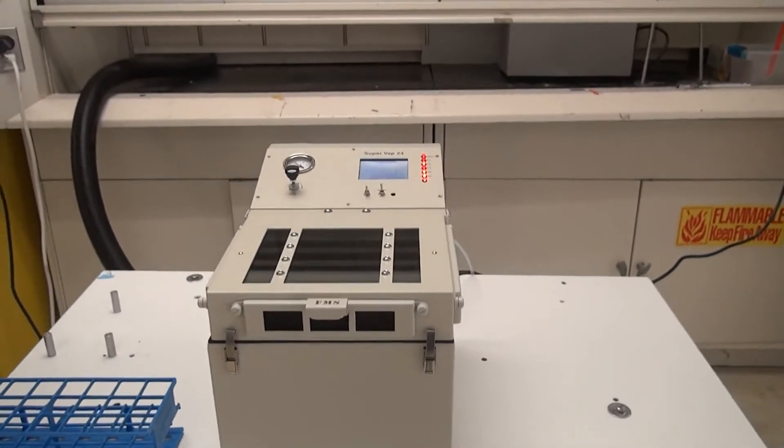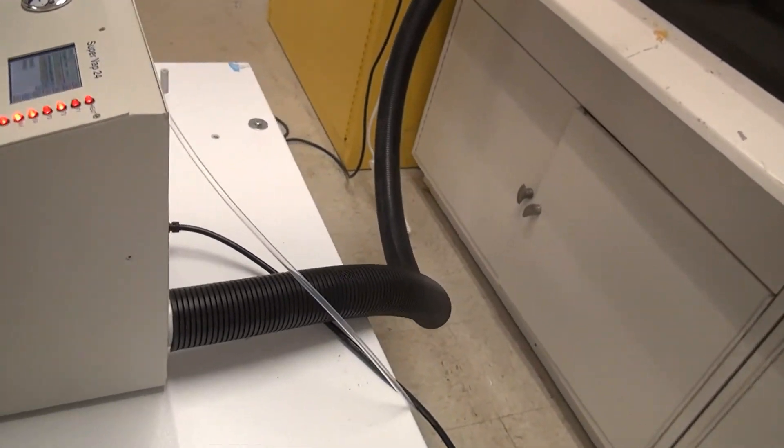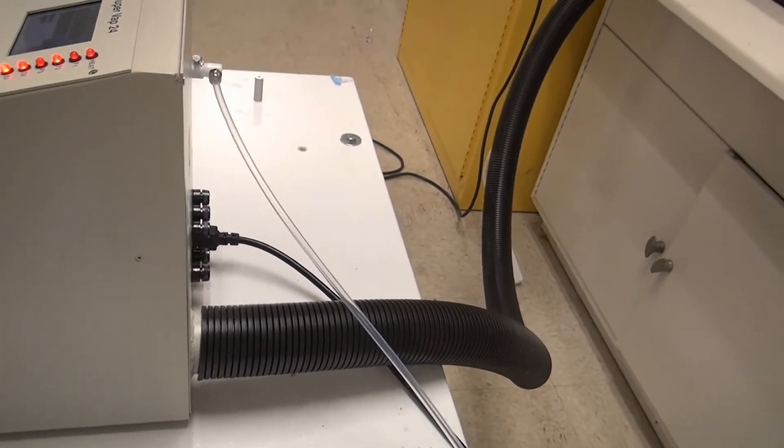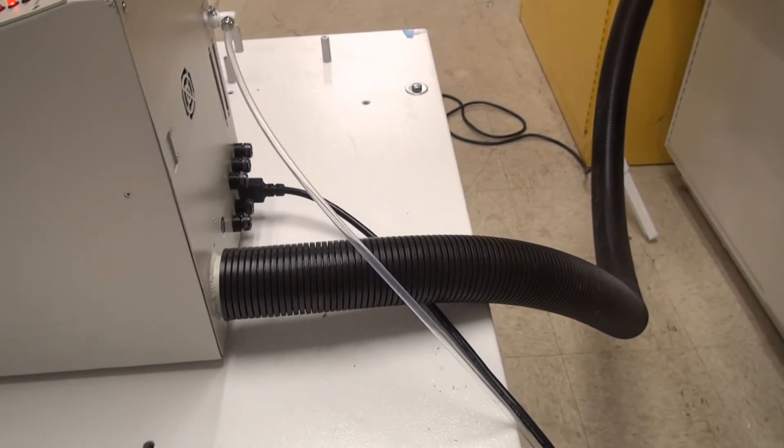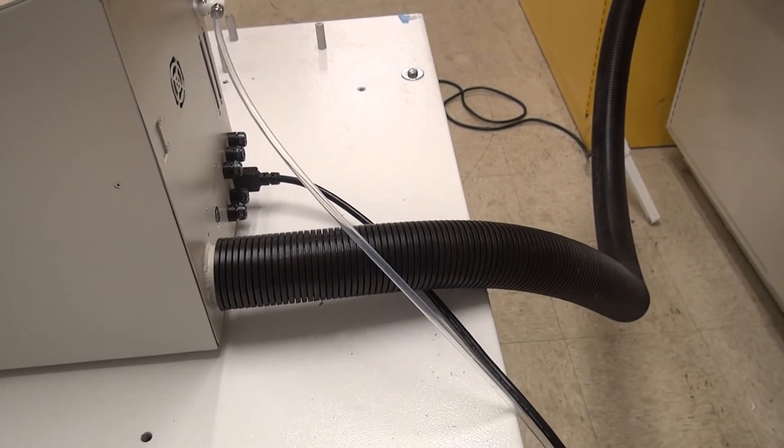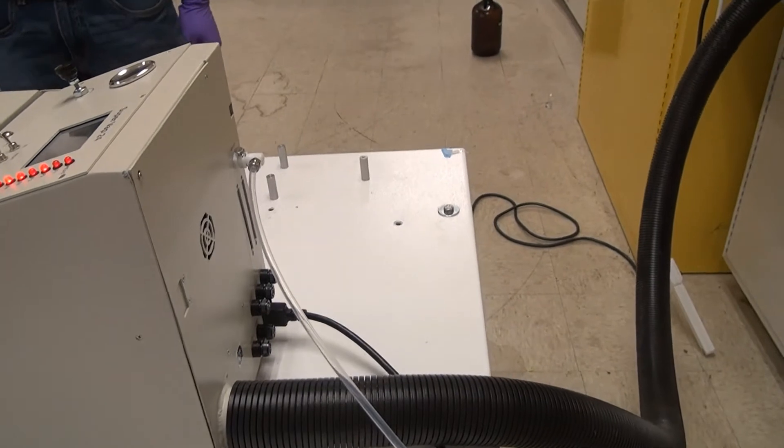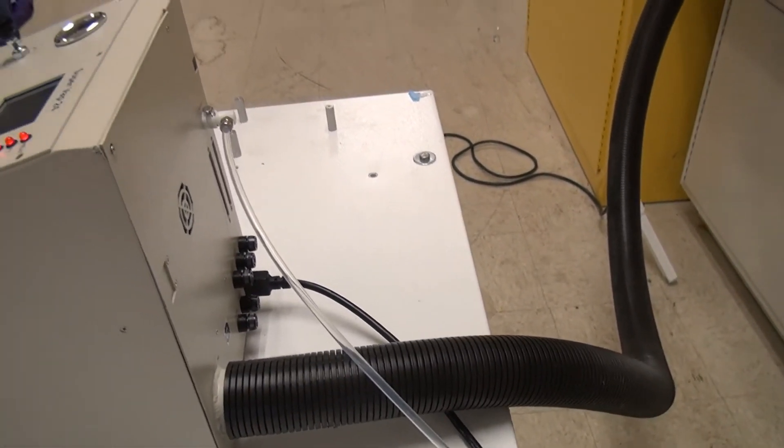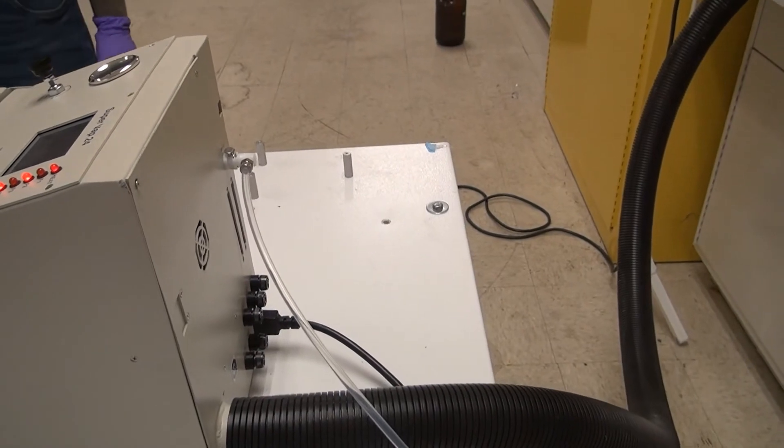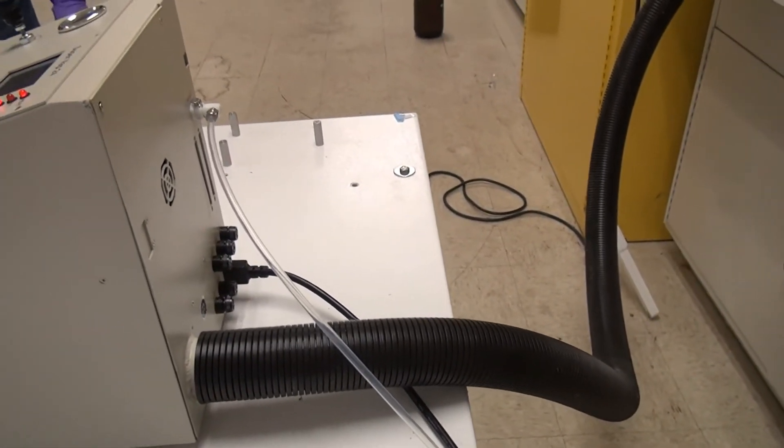I'm going to show you the back of the instrument quickly here and as you can see this can be run completely outside of the hood. There's a nice exhaust fan there with a very powerful exhaust fan with an exhaust hose that comes with the system. This is a quick disconnect nitrogen fitting, so your nitrogen you want coming into that at 40 and then just here, power switch in the back.